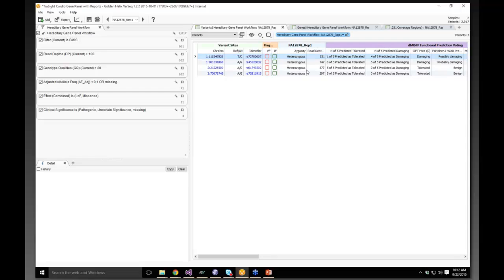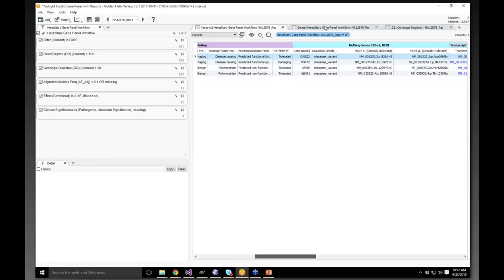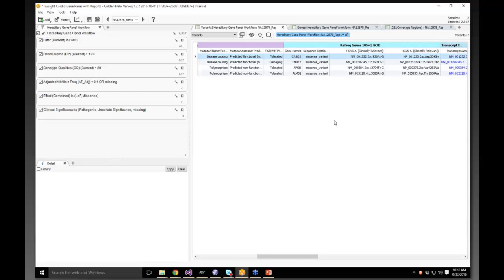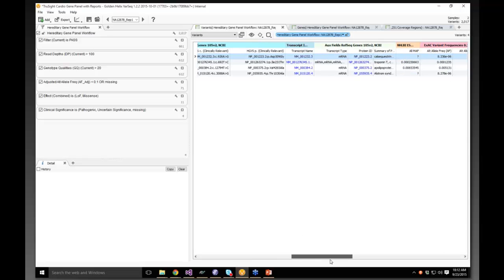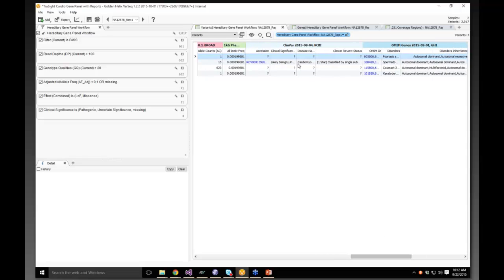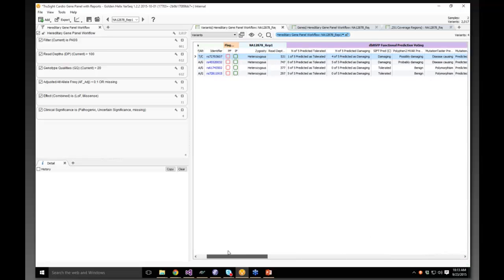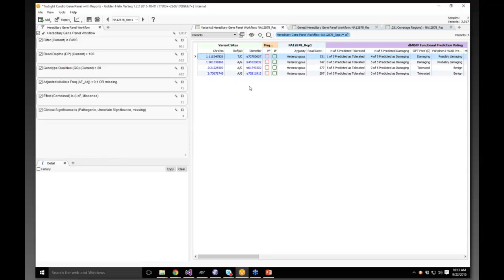These 4 variants, you can see them at a variant level here, including lots of annotations, which genes they're in, their CDOT and PDOT, number of annotations we have applied here, allelic frequencies from different sources, and ClinVar, etc. And also that extra OMIM information that I mentioned, including information about the inheritance model of various disorders that we have here. So that's a great resource for understanding how this gene interacts with phenotypes.